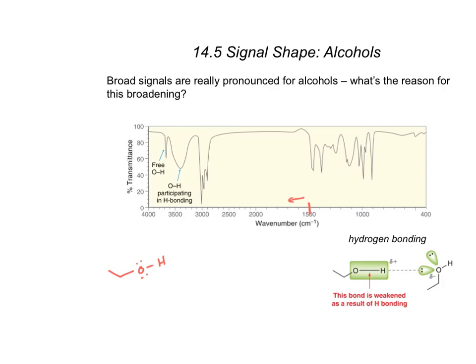When we talk about double bonds, they end up being between about 1,500 and about 1,800. We talked about where we could expect double bonds, depending on the atoms. Triple bonds are a little bit higher, about 1,900 to about 2,300. So these would be triple bonds. Anything above about 2,700, who is that telling us about?